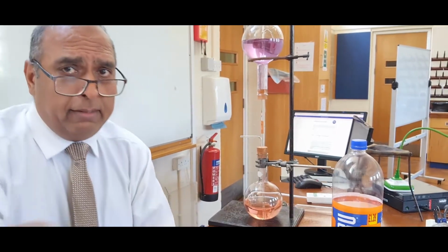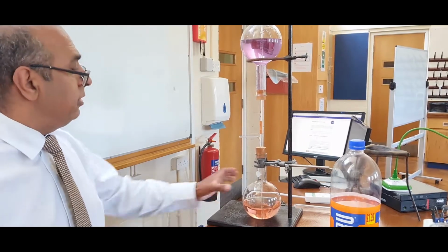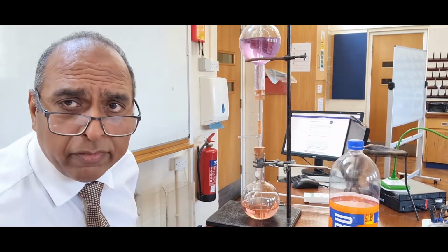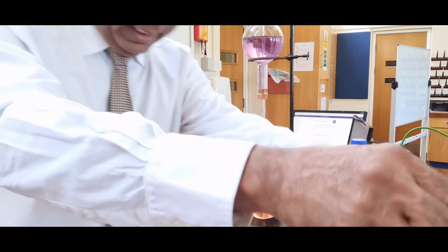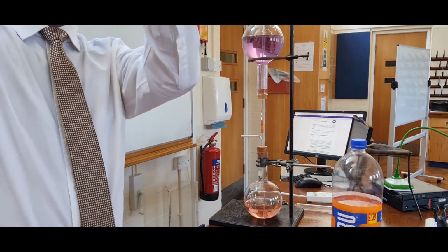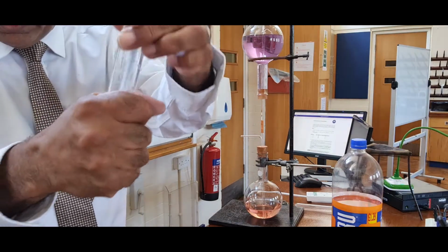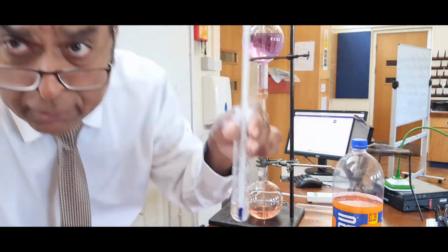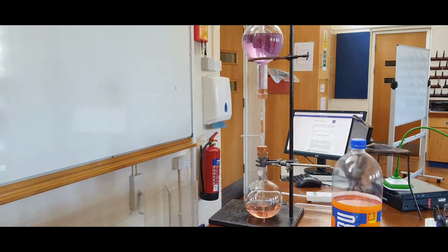You can see most of it now has been sucked from the bottom to the top. It will go on a little bit more and then it will stop. While I leave that for you to look at, I've been keeping an eye on this, and I've not yet got crystals. So I'm going to run it under a cold tap to try and get crystals to form.